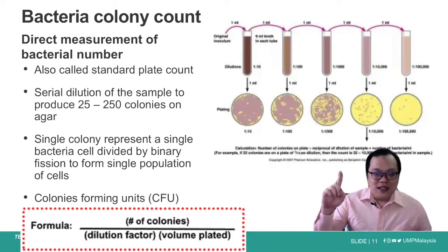As you see from this example of petri dishes of agar plates, in the first plate the bacteria have grown confluently on the agar plate. Therefore, we are unable to count the colonies. We usually term this as too numerous to count.